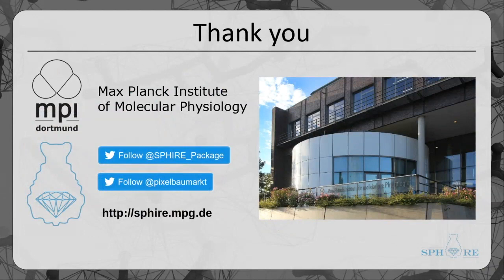So another one. In the paper, you mentioned various ways of augmenting the data, pixel dropout, flipping, etc. What ways are there to encode these directly in the objective? I'm not sure if I got the question. Yeah. So the data augmentation, yes, is used internally to get a better convergence and less overfitting.